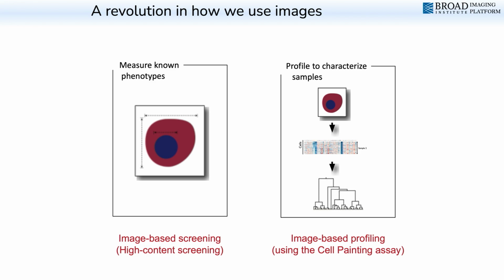By that I mean you can try to find a signature of the cell as a whole, right? So just the way you can take a face and try to get a fingerprint, a profile of that face, you can do the same thing for cells in a very unbiased way, collect all the information you can, and then use that information downstream to go and solve problems. For those familiar with terminology in machine learning, this is just a featurization approach. But when it comes to using it in biology, it's really powerful.